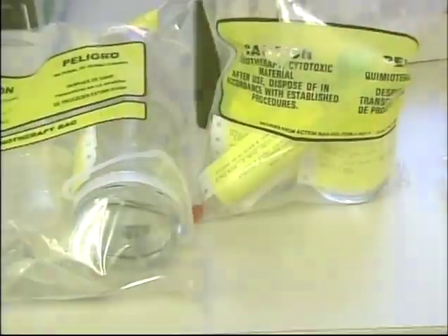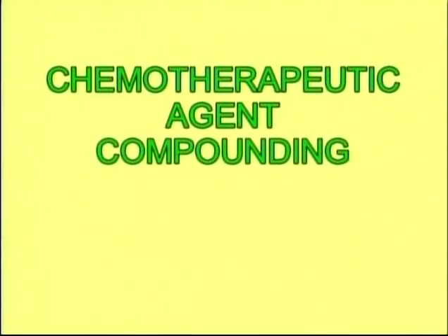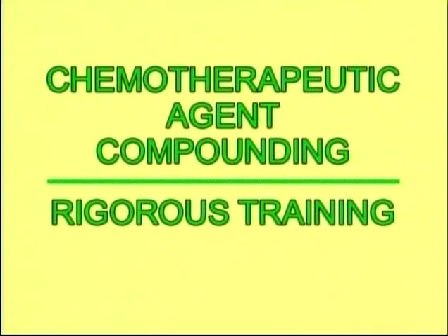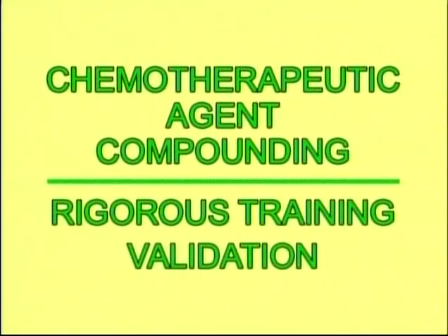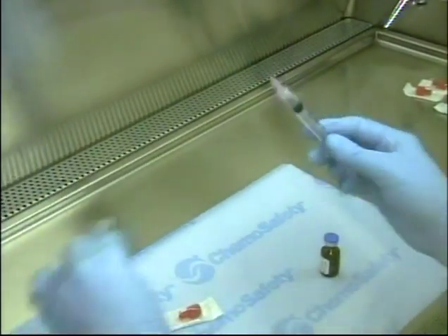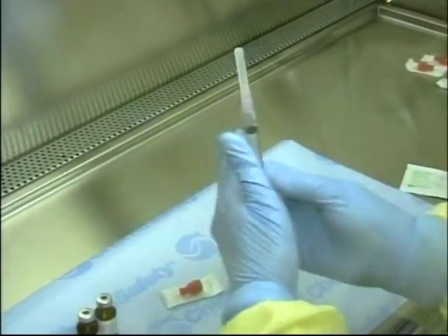This course is not intended to be a complete training program in chemotherapeutic agent compounding. However, a number of precautions are mentioned throughout the program and should be strictly adhered to. All practitioners involved in compounding of hazardous materials should undergo rigorous training. This should include a validation exercise designed to verify their ability to compound aseptically without transferring contaminants to the general environment.